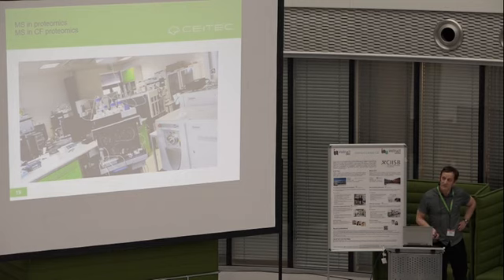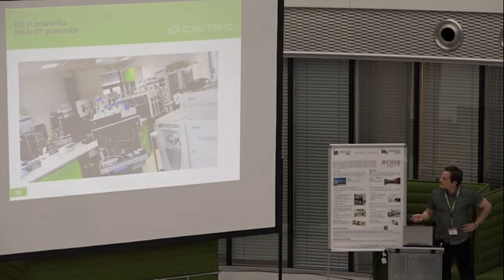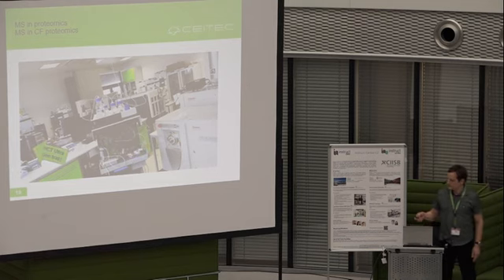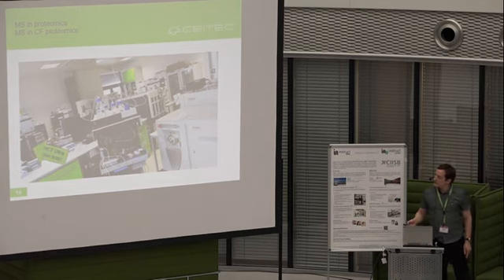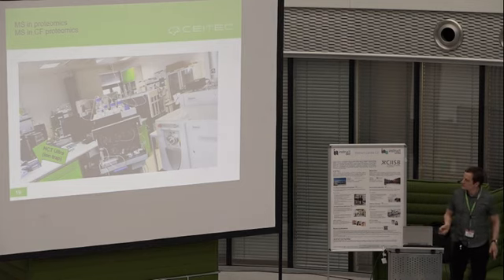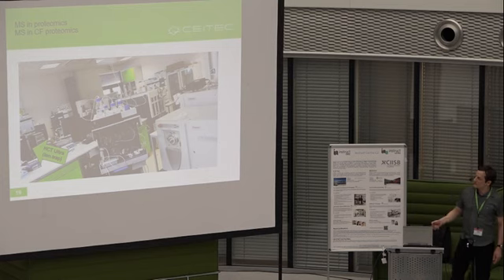That's also a reason. But the main reason is that each of these LC-MS systems is able to reveal another feature of the sample, and can respond to another type of question that you pose to the sample. For example, this mass spectrometer based on ion trapping, 10 years ago it was the best mass spec we had, now it is the weakest one, and now it is just used for checking the digest quality.